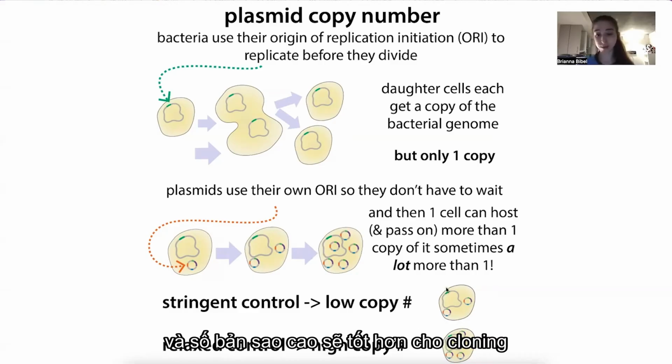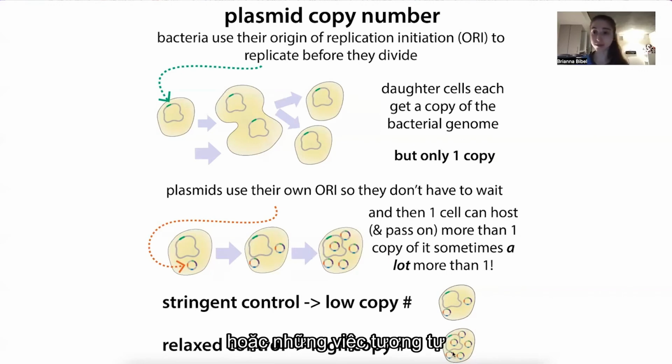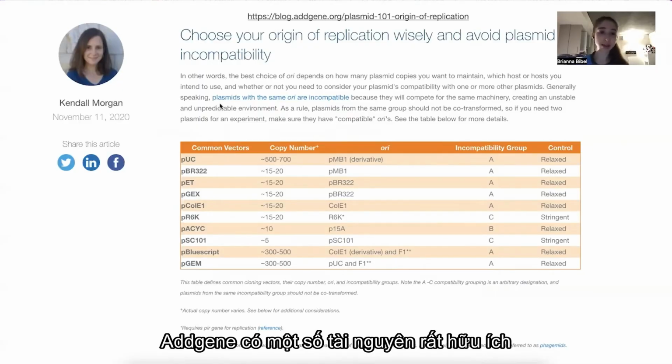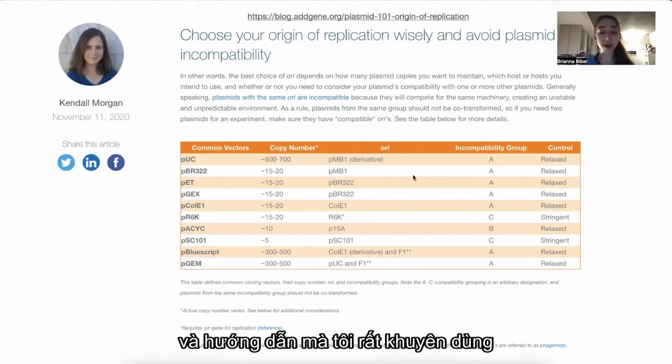So typically a lower copy number would be better for protein expression, and a higher copy number would be better for just doing cloning, if you want to make a lot of DNA, various things like that. This is going to depend on that origin of replication. Addgene has some really great resources. They have this Plasmid 101 blog and guide that I highly recommend.